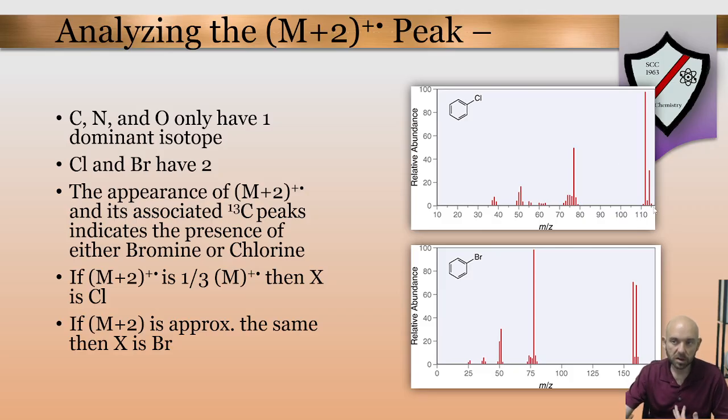this grouping down here, as we've indicated earlier, is going to contain your molecular ion peak. It's going to have the peak of just the molecule with the one electron knocked free, and so it has a charge, but it also has the same mass as the parent molecule, if you will. Sometimes we see two large peaks in this grouping, and the first one is always going to be bigger than the second one. We have our molecular ion peak first, then an M+1 peak following it, and then a molecular ion +2 peak after that.